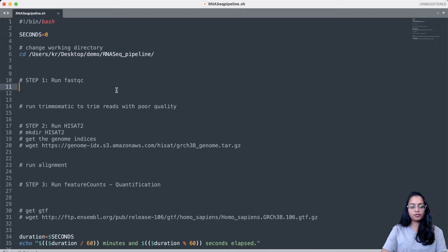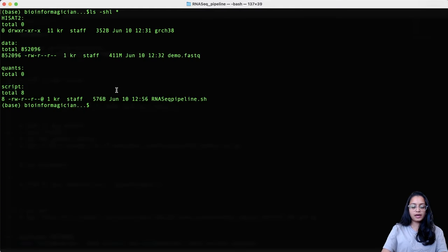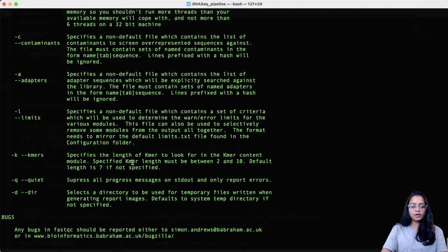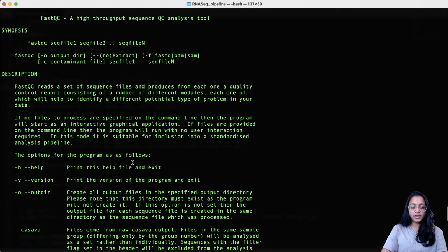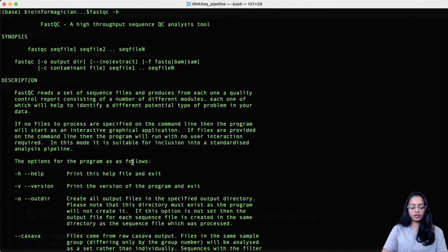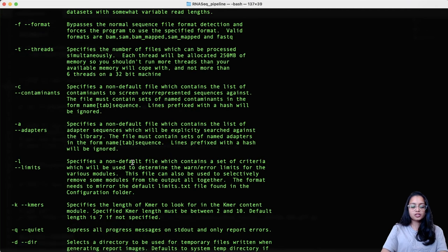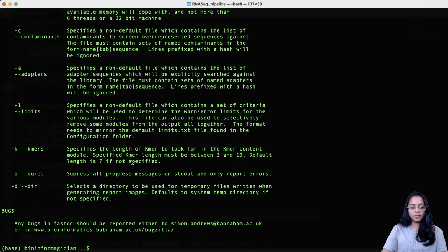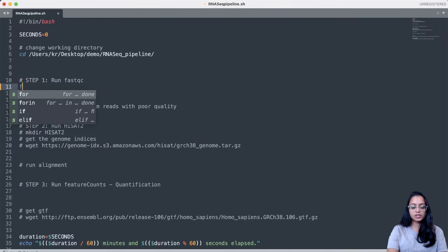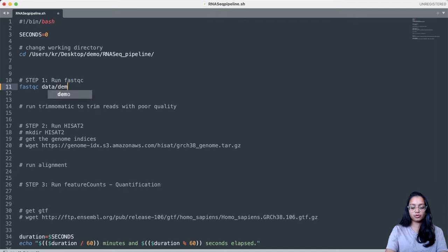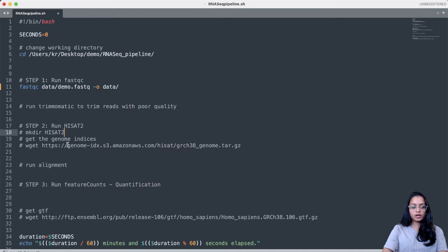The first step to process RNAseq reads is to perform quality control using FastQC. In the terminal, you can type 'fastqc -h' to open the help page, which shows expected inputs, outputs, and additional options. It's always recommended to check the help page before running any tool. I'll run FastQC on the input file demo.fastq in the data folder, with output also going to the data folder, so we can assess the quality of the reads and decide whether trimming is needed.